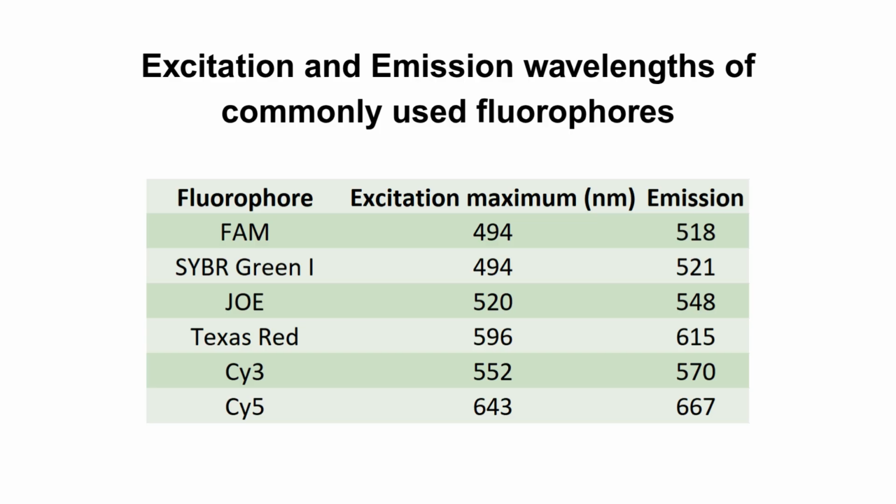So I kept on saying this excitation emission, and this is a table which is explaining to you the commonly used fluorophores in real-time PCR and what the excitation and emission maximum of these fluorophores are.